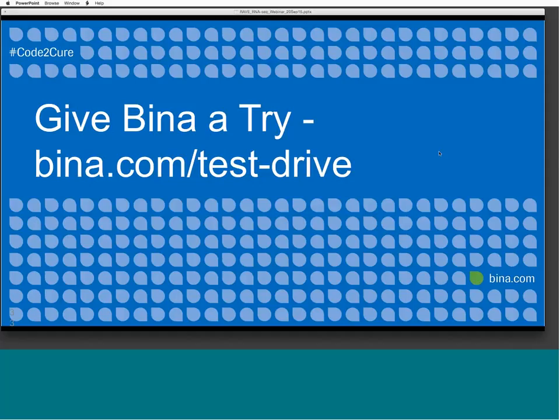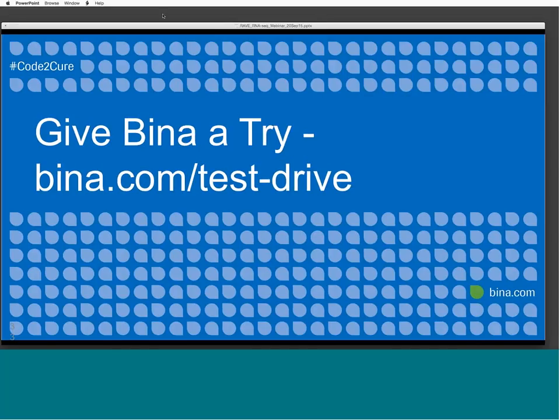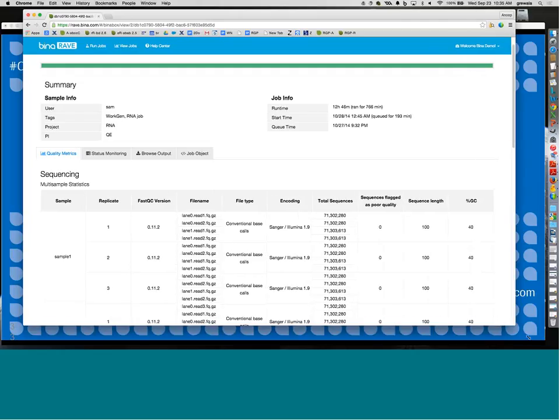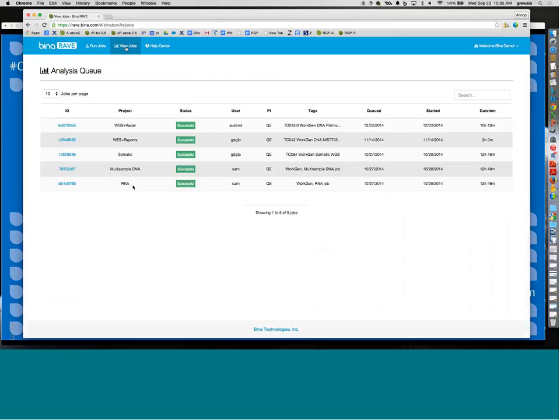There's a question about what the QC looks like. So, Anoop, are you able to give a quick demo of that? Sure. All right, we have Rave open, and under the View Job section, we're taking a look at an RNA-Seq project.